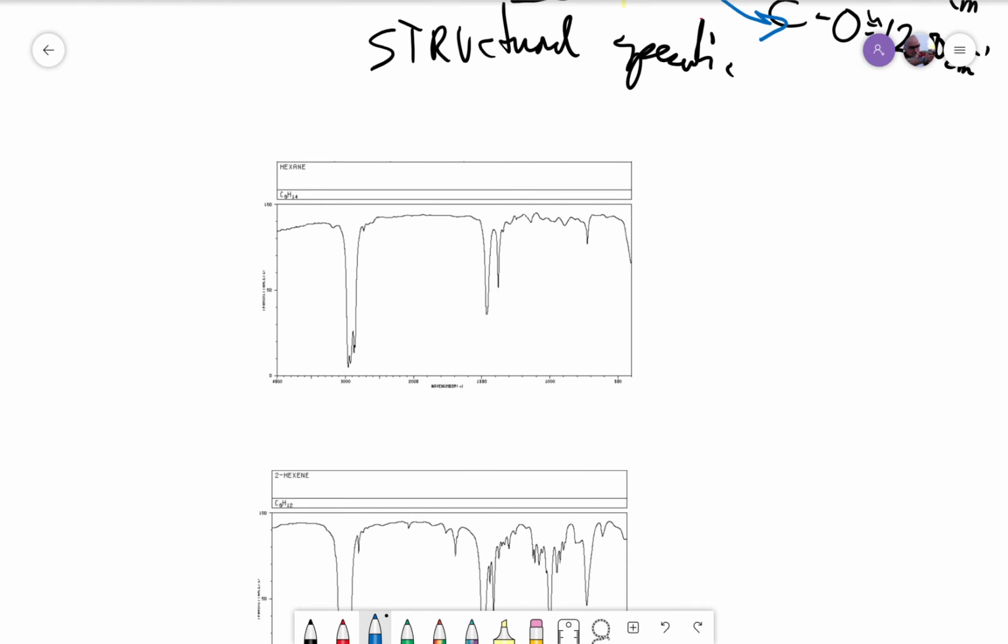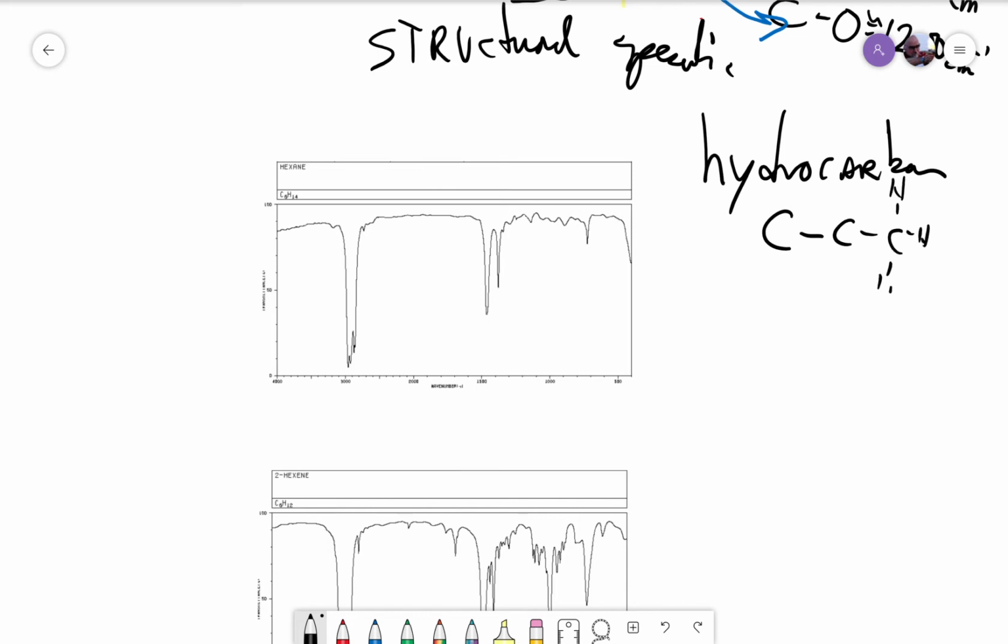One of the first things that we want to be able to structurally identify is, since we're working with hydrocarbons, what is the nature of that hydrocarbon backbone? Using organic nomenclature, if everything has single bonds, so you've got as many bonds around that carbon as you can and as many hydrogens, this is called saturated with hydrogens.